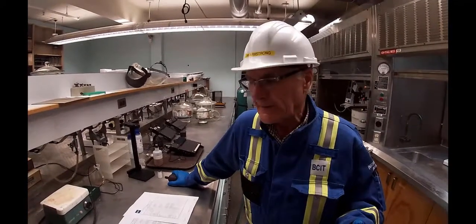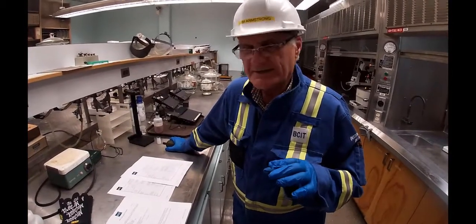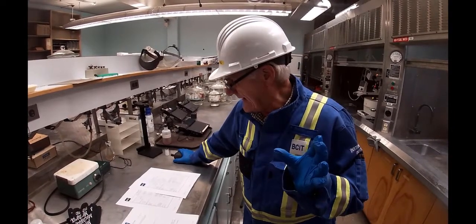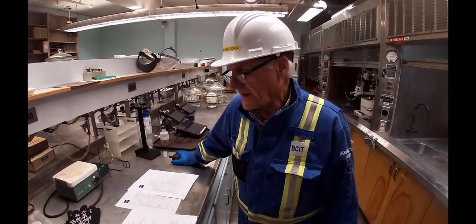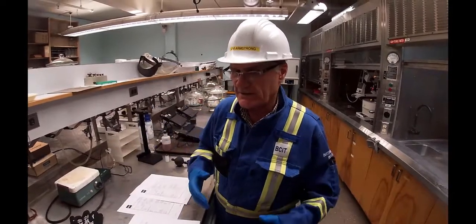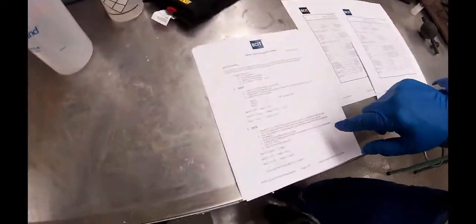Okay. So in a pulp mill, the recaust operator, the operator who's looking after the area that is making the liquor, runs tests on the liquor. And what he's looking for is to find out what the causticity is, what the alkalinity is, what the activity, sulfidity, the number of things he needs to know. And again, that's done by the operators, but we as technicians who are actually controlling this thing need to know the background behind it. So we've got a laid out procedure for the testing.